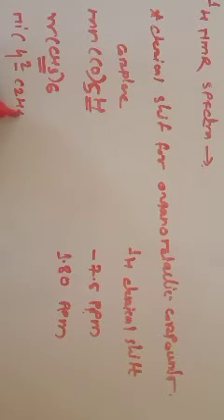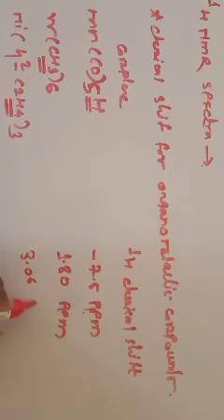Okay, the next one, if you consider the next complex, that is your nickel complex, in which the hapticity of this ligand is 2, that is your ethylene ligand, C2H4 thrice. And we are discussing the chemical shift value for this proton, that is the ethylenic proton. Then it is 3.06 ppm.